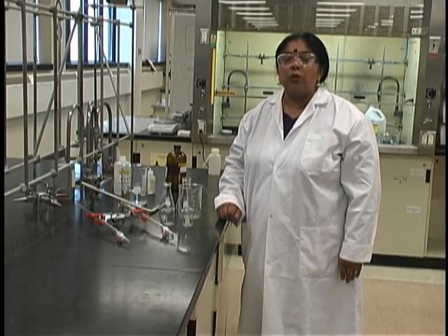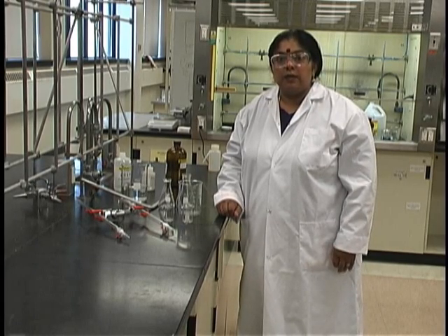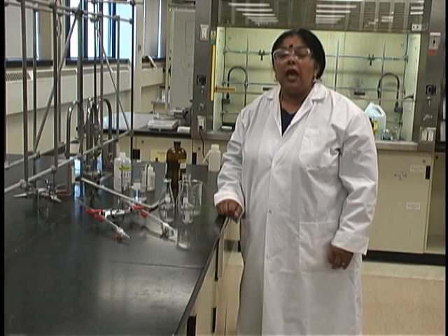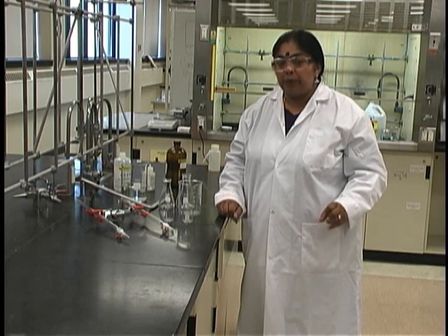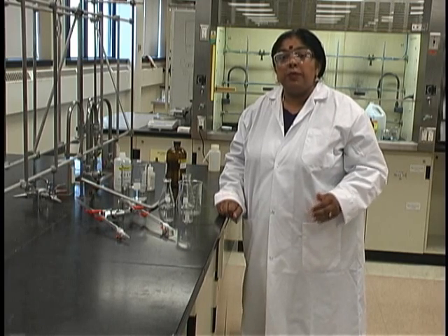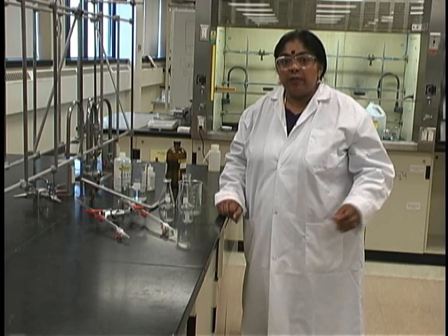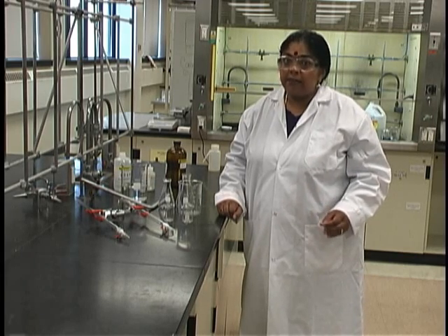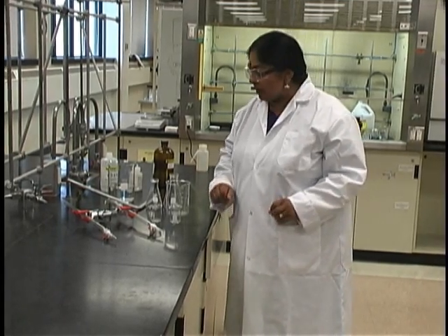For the first part of the experiment, you will need to prepare your own NaOH solution. It's very important that you prepare the solution as well as you can, and bear in mind that once you have prepared your own NaOH solution, that is the solution you will be using for the rest of the experiment. If you run through that solution and there's none left, you will have to start the entire experiment over again, so do be aware of that.